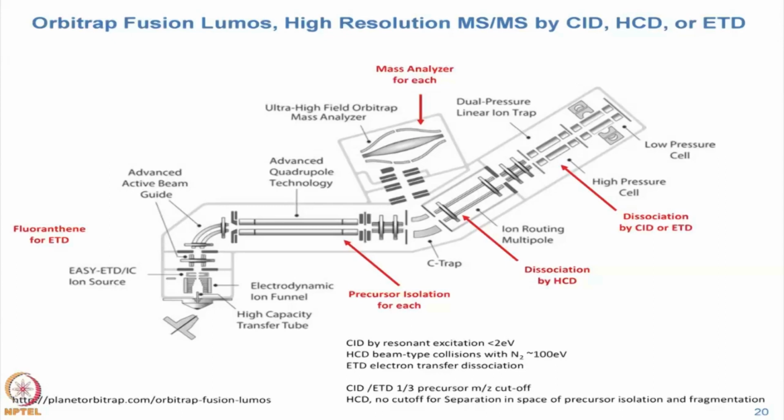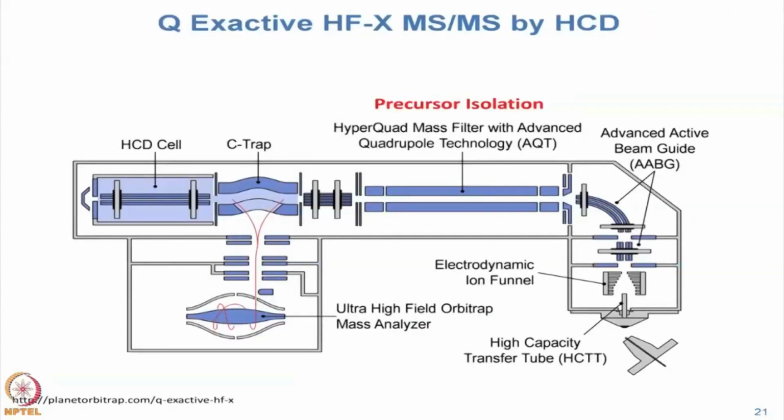In practice, in the CPTAC program for generating proteogenomic data, we generate only HCD spectra, and we collect mass spectra only in the Orbitrap. So we're not taking full advantage of the instrument. The reason we're using those instruments is because this instrument, which does only the things that we really want to, didn't become available till just earlier in this year, and we started the grants that we were doing a year before that.